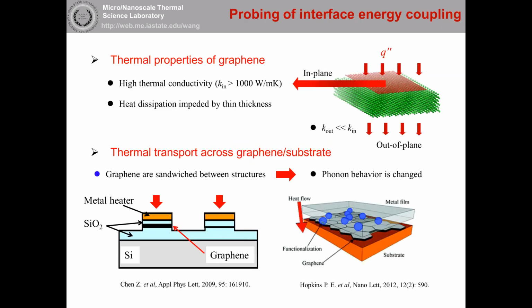The final point, I think, is that near field focusing shows the unique things of Raman spectroscopy. It's non-contact. You can really measure some areas for temperature that were almost not measurable before. I think the most exciting thing about Raman spectroscopy for temperature measurement is the highest temperature resolution in space. Why is that? This one shows interface energy coupling, and it gives the idea why Raman spectroscopy is the most advanced and most useful one.